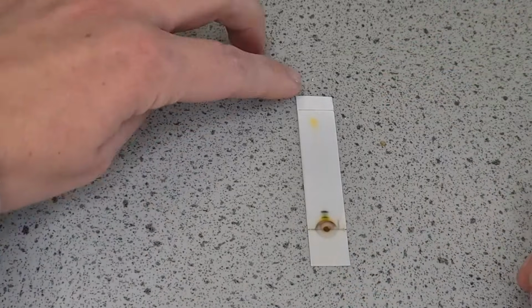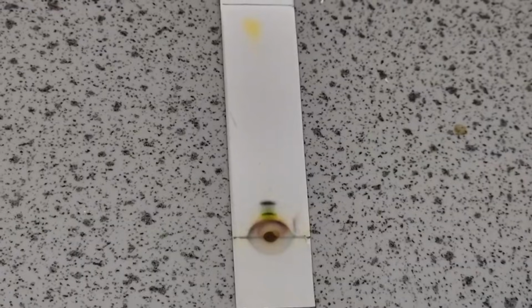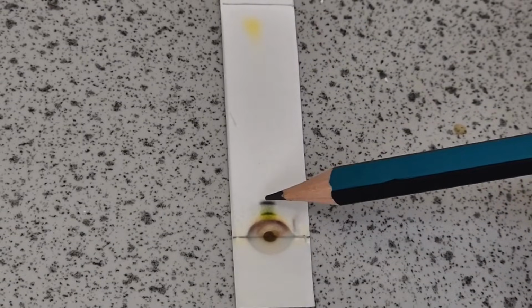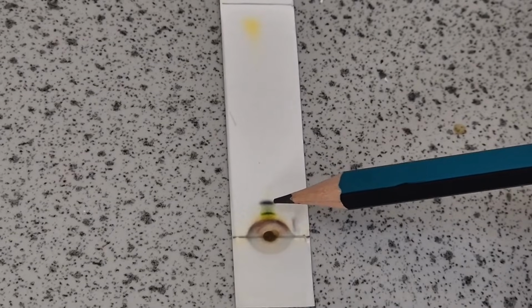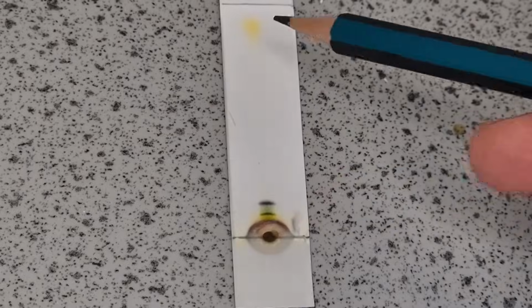Now to get the students to take a photo at this point before any of the pigments fade. And then what I can see is we've got a faint yellow one here, and then a dark grey, green, a yellow. There's 3 distinct other ones as well that I would measure the RF values for.